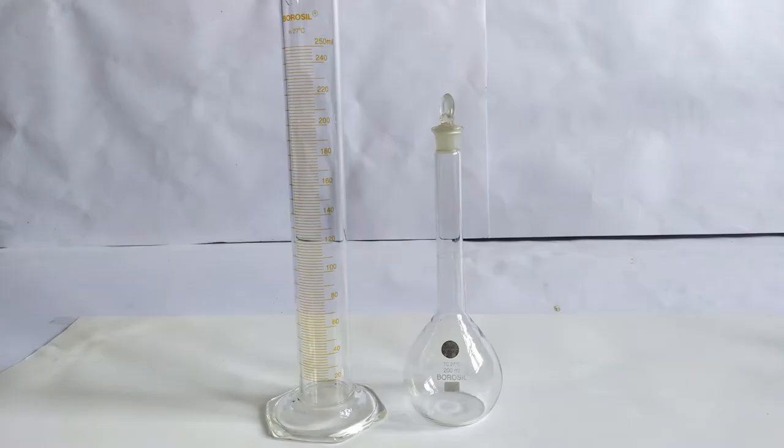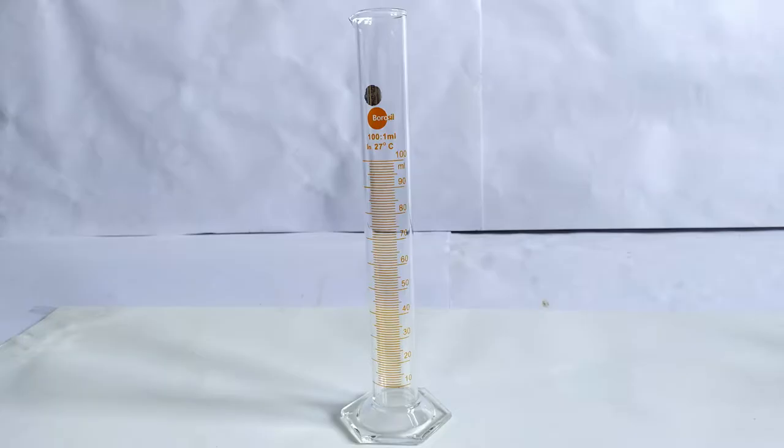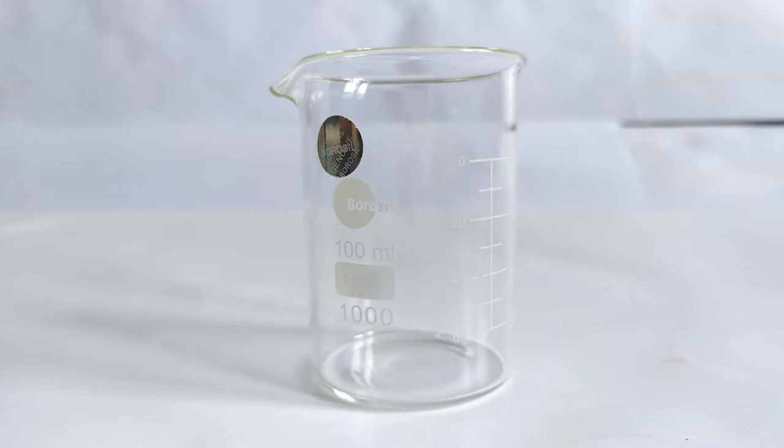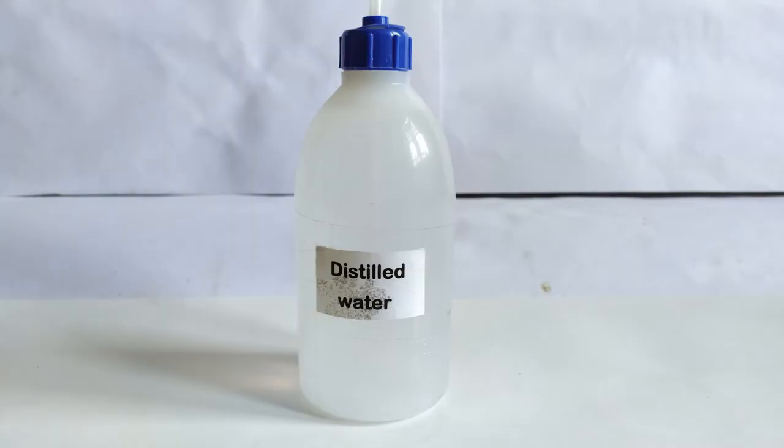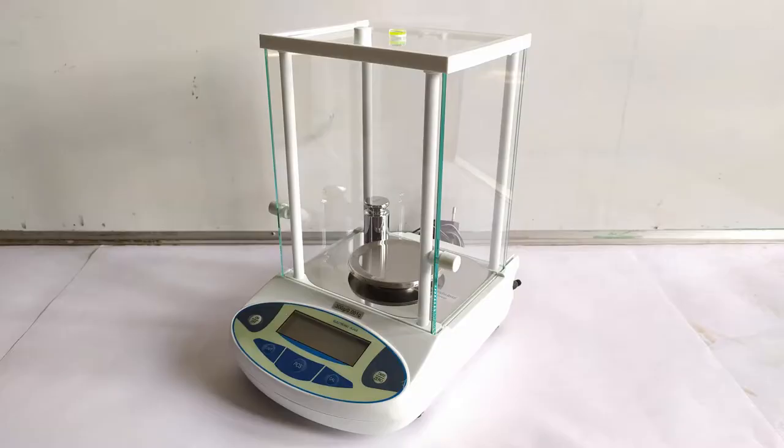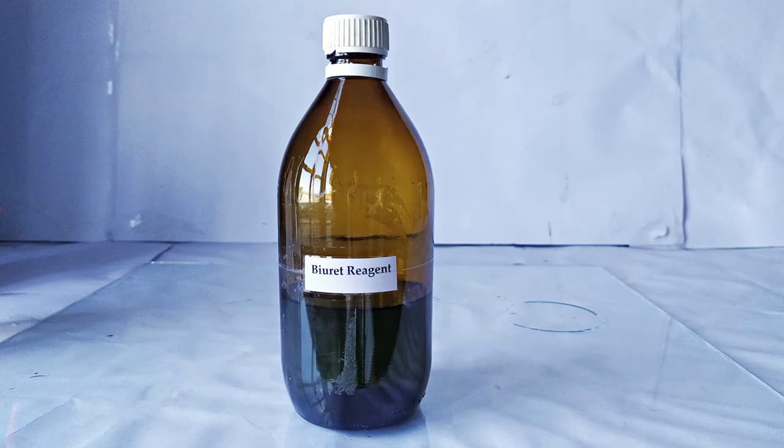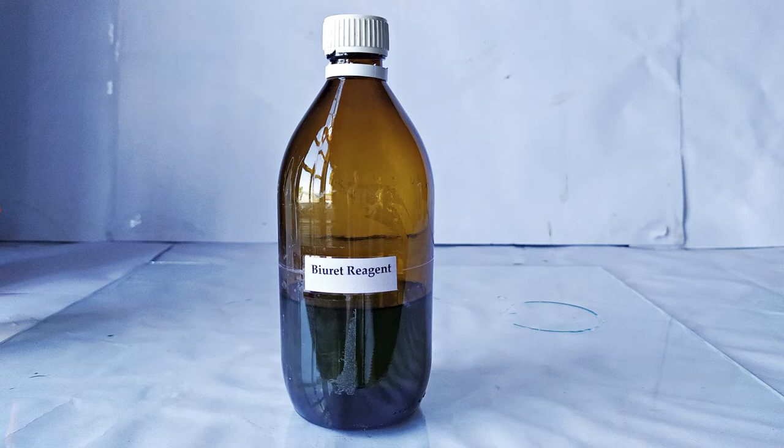You'll also need a 200 ml volumetric flask or 250 ml graduated cylinder, 100 ml graduated cylinder, 100 ml beaker, stirring rod, funnel, distilled water, a dropper or pipette, analytical weighing scale, and a suitable container with tight fitting cap for final storage of the prepared reagent.